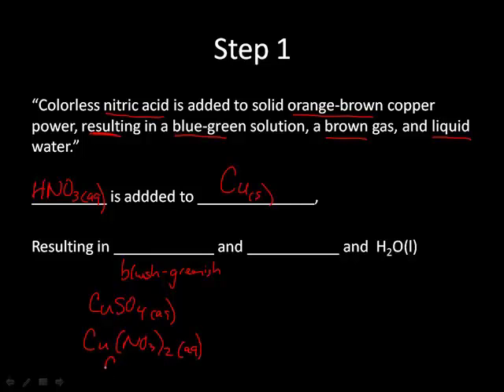And a third option is copper hydroxide. And maybe even copper hydroxide, depending on the color we got. So we have 4 different options.